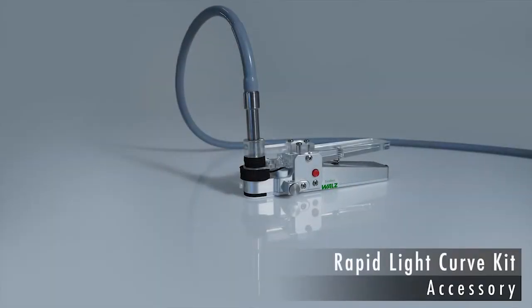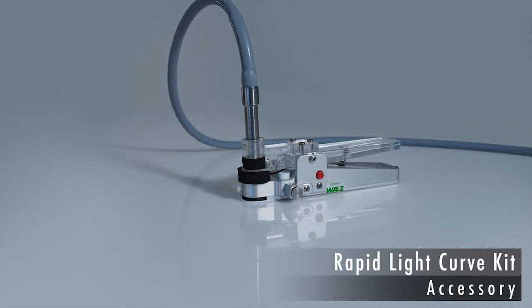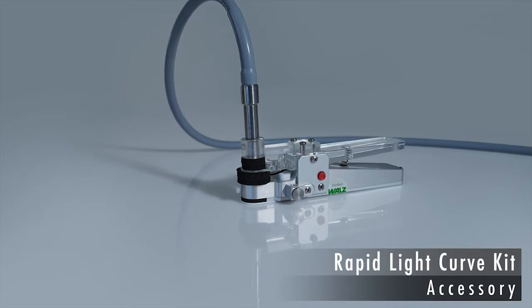To record rapid light curves, a conversion kit for the 2035 B field clip is available to screen off external light.